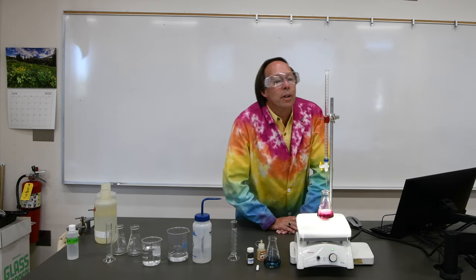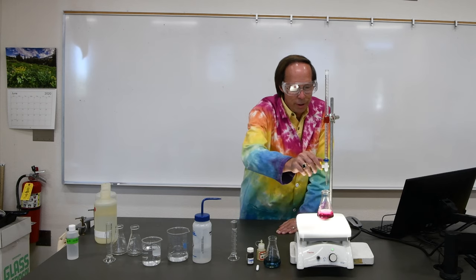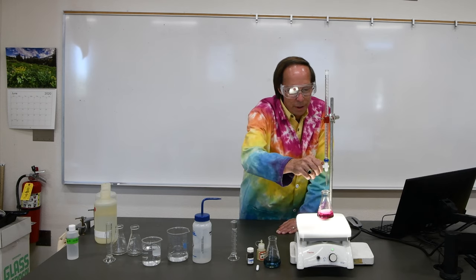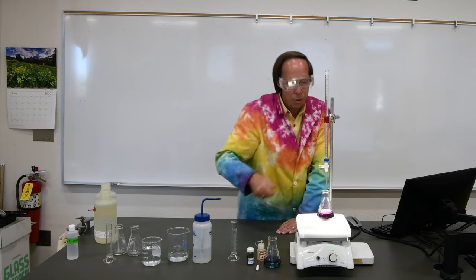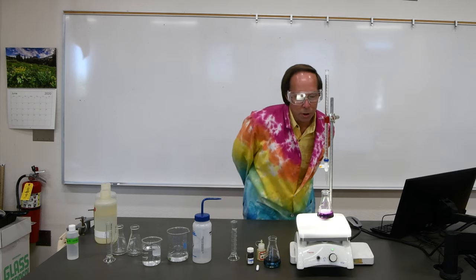Should be getting fairly close here. Are you ready? Looks like a subtle bit of a color change. All right, it's turned purple. Let's see if it gets all the way to blue here.